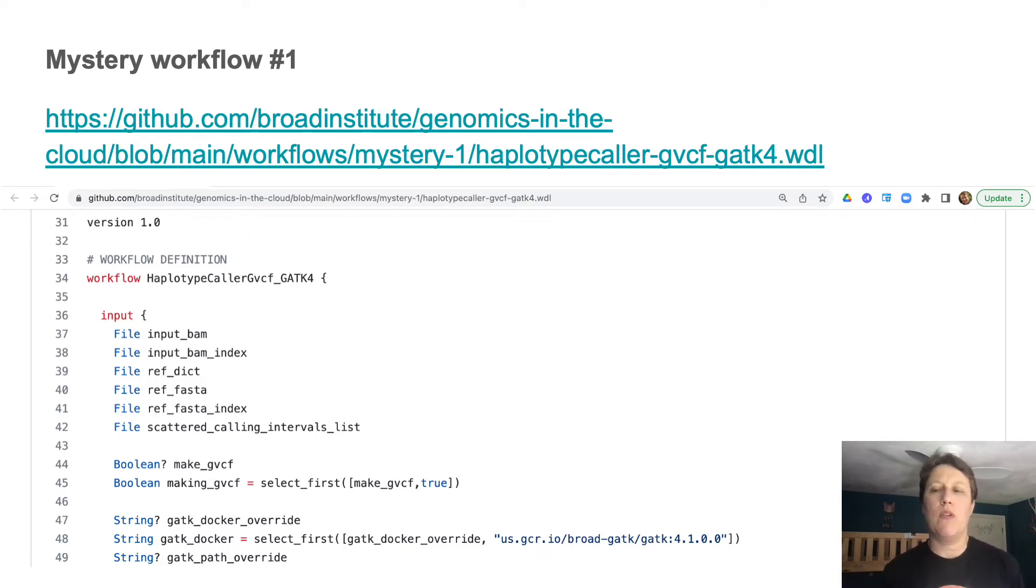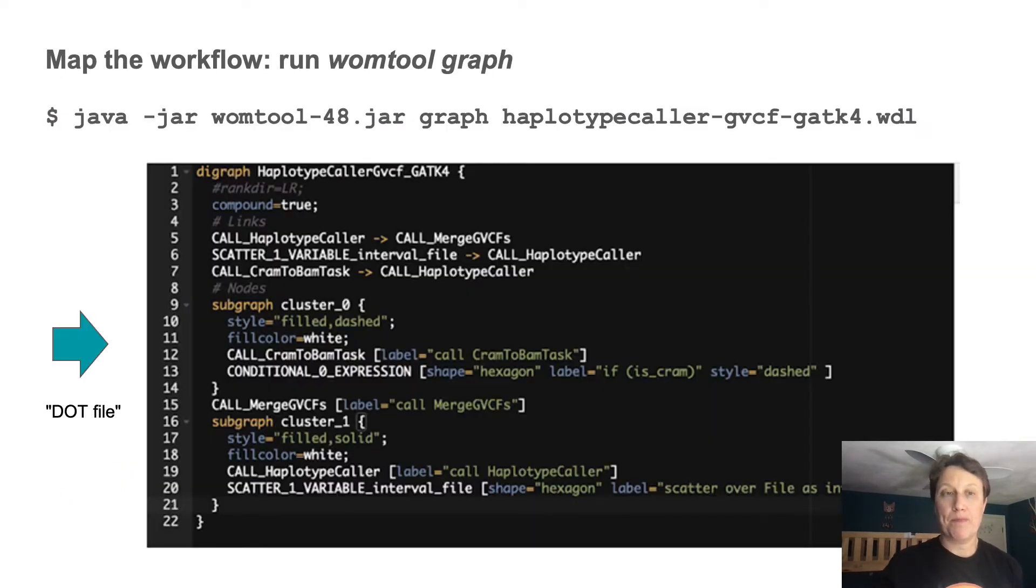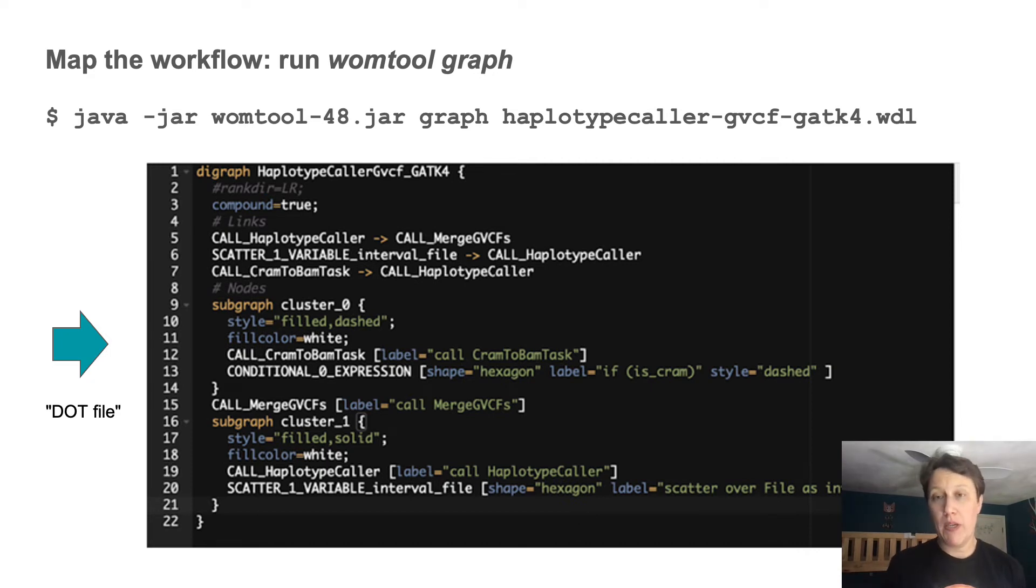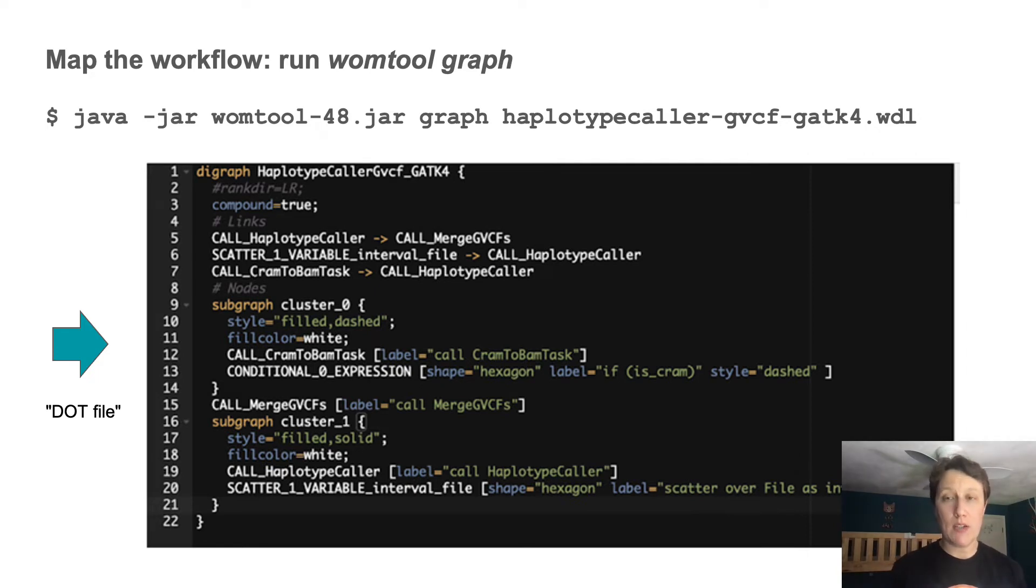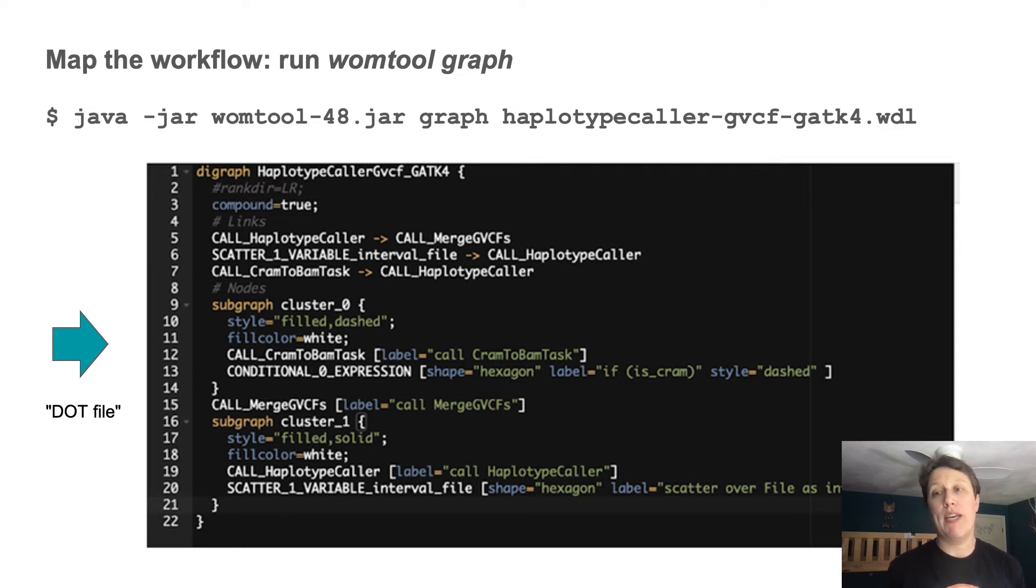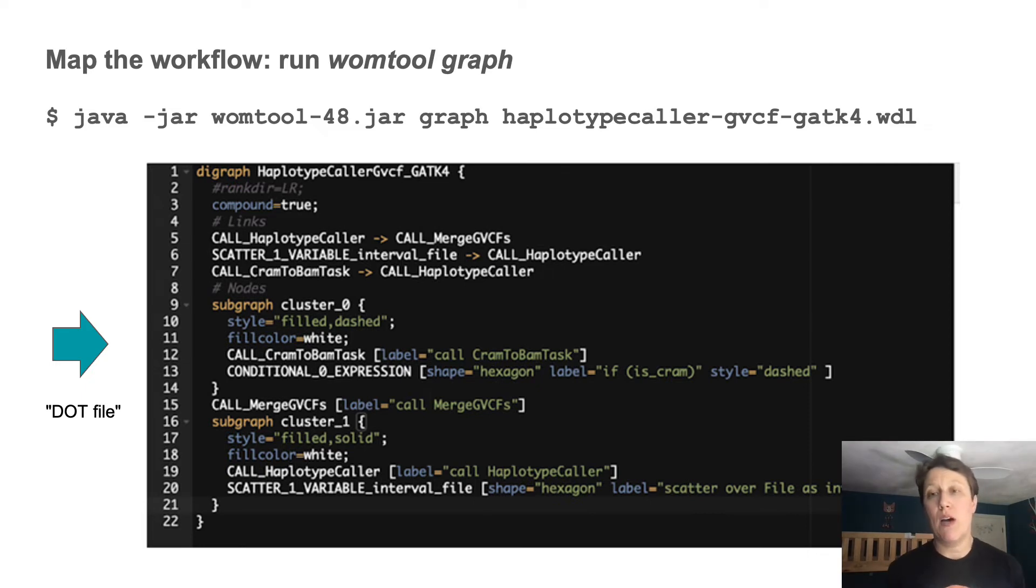So one way to deal with that is to use an editor with code folding capabilities. But here we're going to see what we can just do looking at the code with minimalist tools. So step three, step three is the one that requires a direct action in this method, because it involves running a utility called womtool to output a graph description for the workflow.